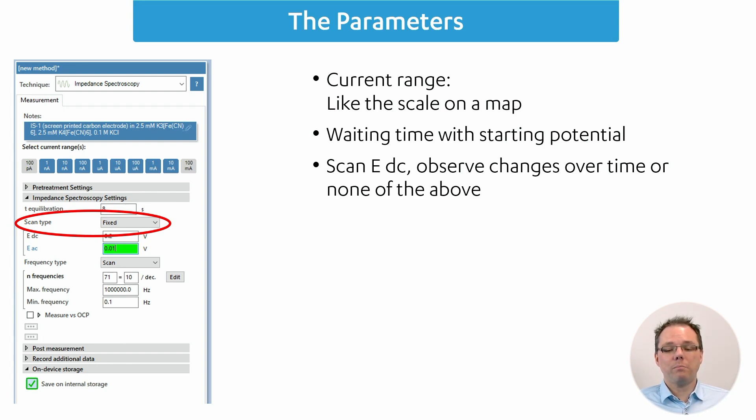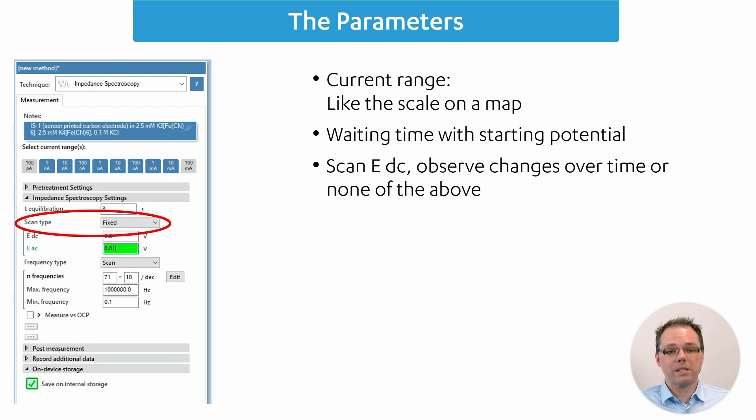Most of the time when people choose here a scan option, they also want to fix the frequency and then follow the impedance over time, or want to see the change of impedance if they change the EDC. Usually the scan type fixed is the classic way of doing impedance spectroscopy.